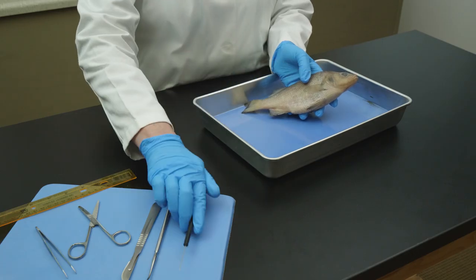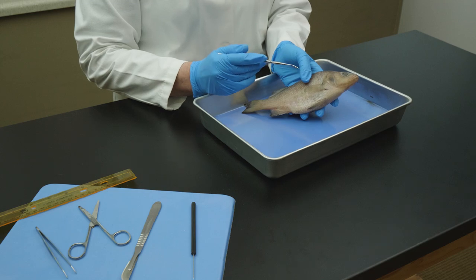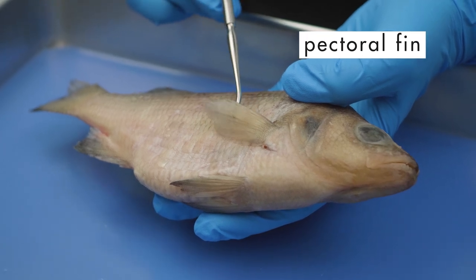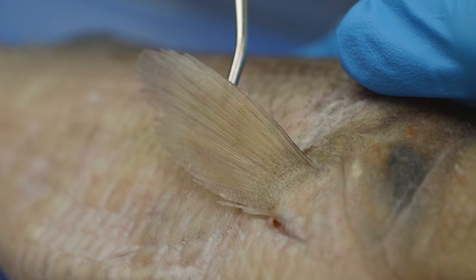One of the most noticeable features of the external anatomy of a fish are its fins. A perch uses 8 fins for movement and stability in the water. Some fins are movable, but others are fixed. The first fin we will examine is the pectoral fin, which is posterior to the operculum. A perch has 2 pectoral fins, one on each side. Pectoral fins are movable fins used for propulsion, steering, and diving.